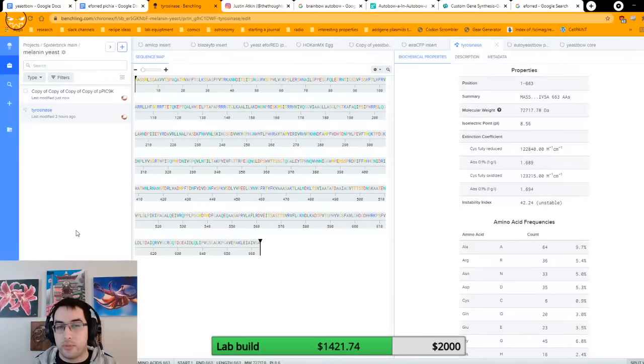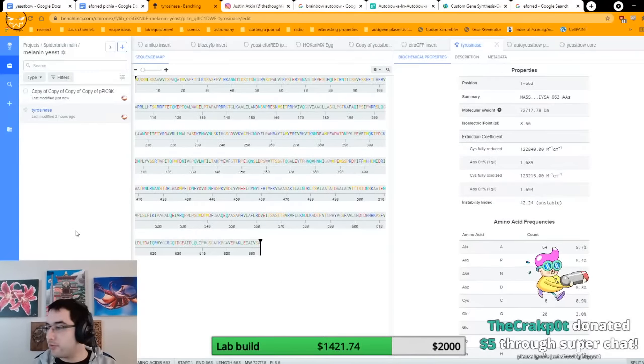The reason I'm making this, I think it'll be a great thing in a kit. It's a great learning tool. It's something other than a chromoprotein. Black is sort of weird. It means you've got to make special media, so you're getting into custom media that has different stuff.